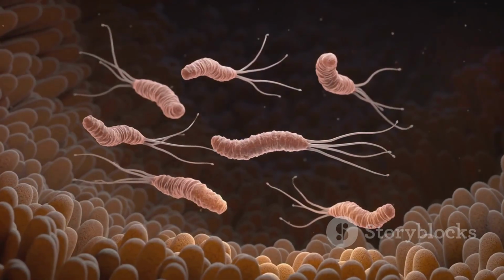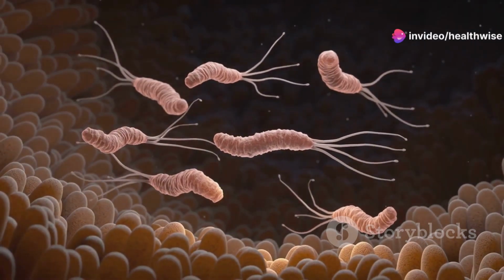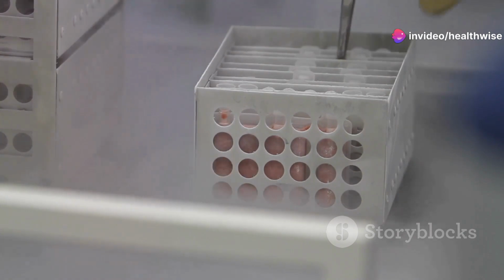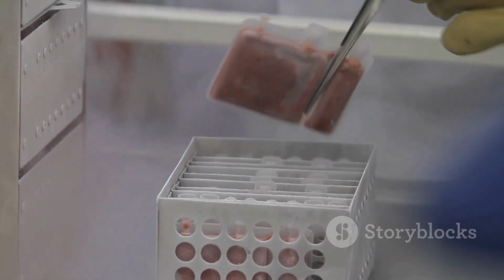Anaerobic incubators create an oxygen-free environment. They are used for growing and maintaining anaerobic bacteria, which cannot survive in the presence of oxygen. These incubators have gas-tight seals and use nitrogen or other gases to replace oxygen.